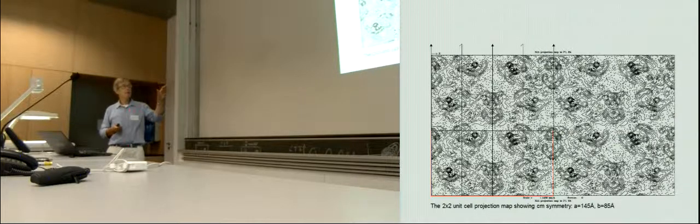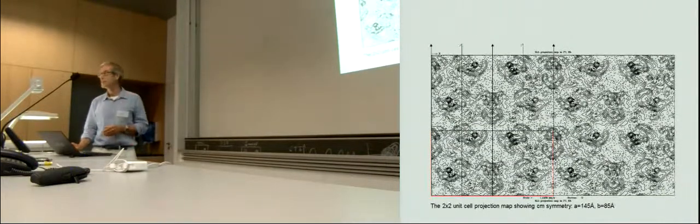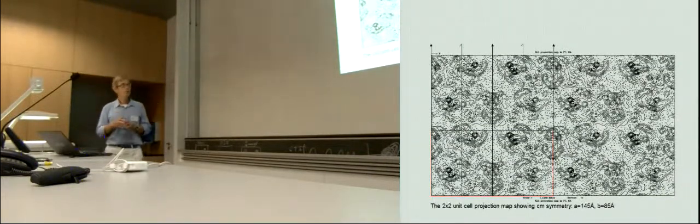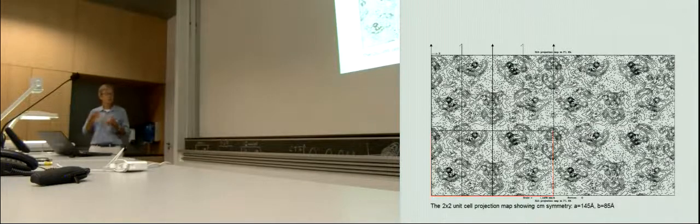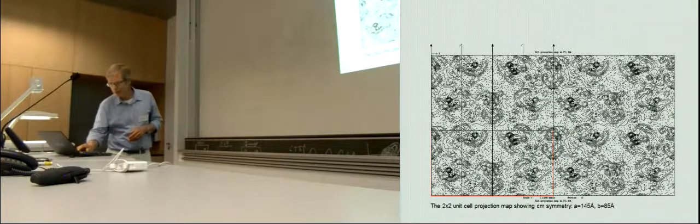So I think in some cases it might be difficult to automate the process completely, at least initially. Once a reasonably preliminary 3D dataset is available, then one can proceed probably more automatically, but at least at the beginning, it's important to check what is really going on. I think this was my last.